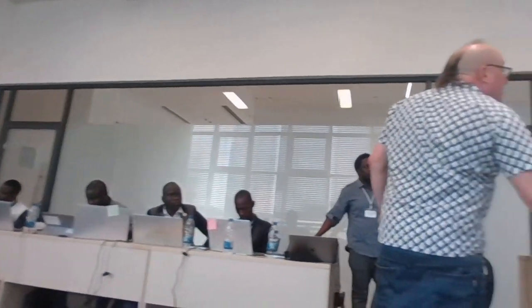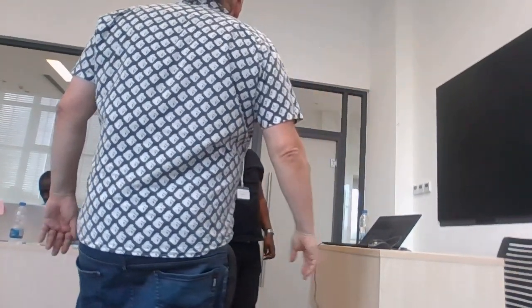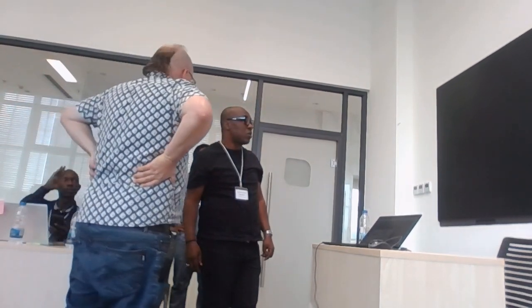Stanislas, can you explain the importance of the Nextclade results in français? Yeah, the quality control. Can you go through these different quality control metrics en français? What is the missing data, the mixed sites, all of those things? You can just give a quick rundown of what the quality control means. If you need any explanation, I can explain to you. Okay. Missing data.